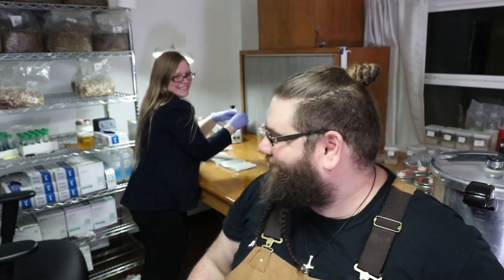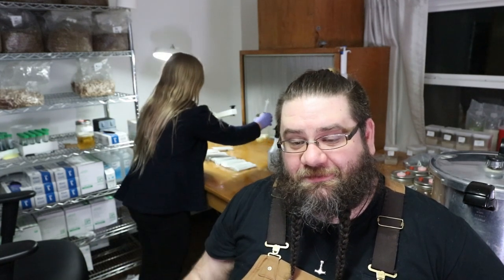Don't throw stuff around. Don't throw stuff around, there you go. And don't pick it up off the floor and then put it down here. If you pick anything up off the floor in the lab, put your glove in the trash and get a new glove.